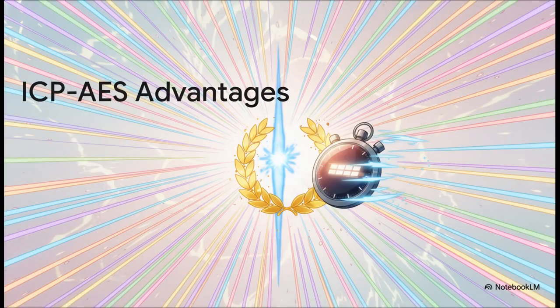So to quickly recap our journey today, atomic emission spectroscopy offers us truly unprecedented speed, sensitivity, and flexibility. The ability to run 70 elements in a single 1 to 3 minute measurement, hitting parts per billion detection limits, all while suffering from minimal chemical interferences, that cements it as the absolute gold standard in modern analytical chemistry.